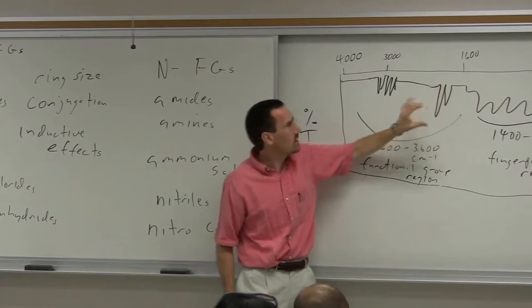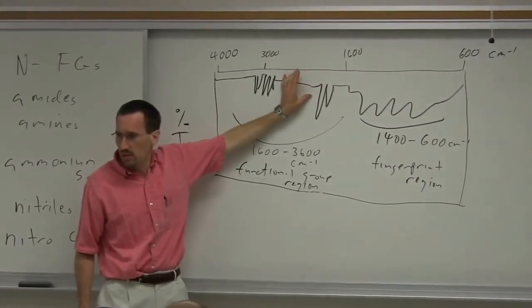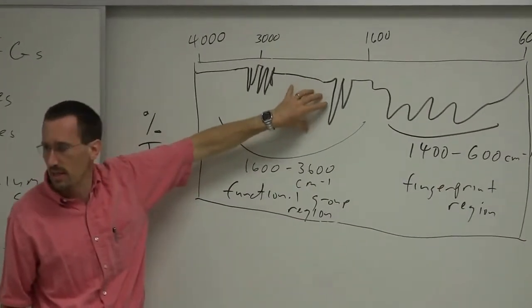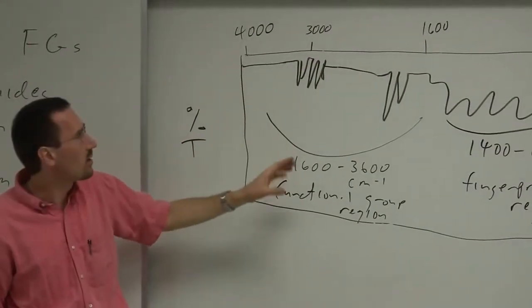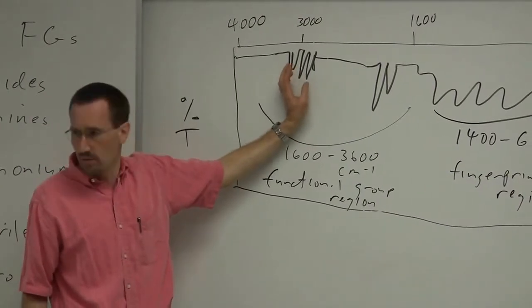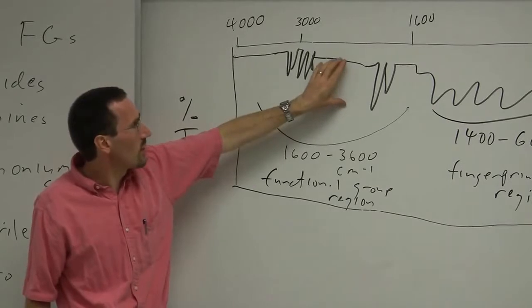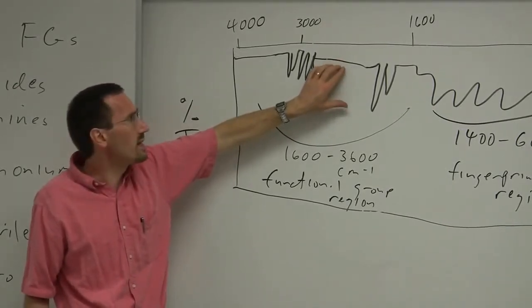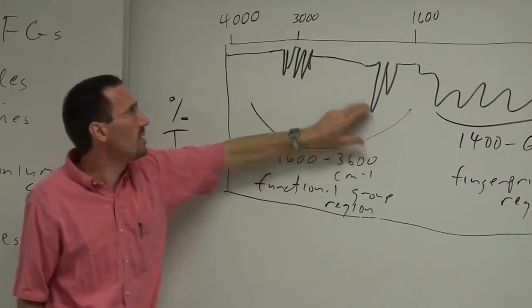I'll look for carbonyls. I'll generally look at this region just above 2000 because normally you don't expect anything there. If I see anything there, it's going to send up a red flag that there may be something interesting. We already talked about alkynes. Generally, I won't pay too much attention to this region right below 3000. But there are a few things that can show up here at about 2820 and 2720 that can be indicative of an aldehyde if you have the right sort of carbonyl peak.